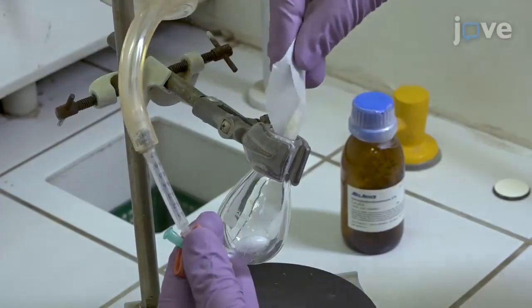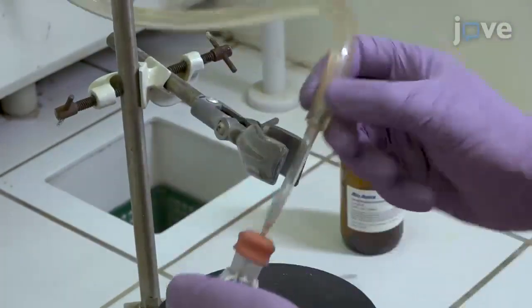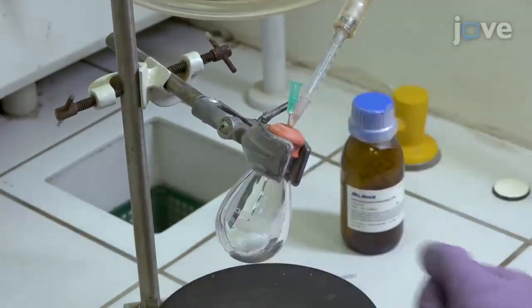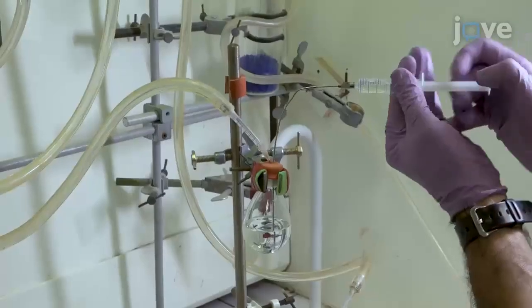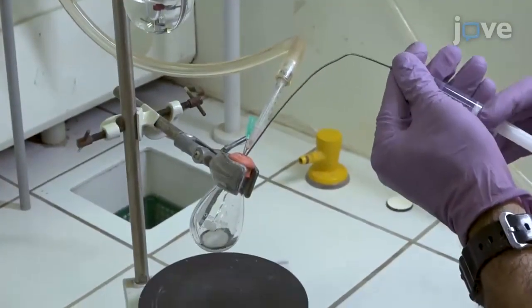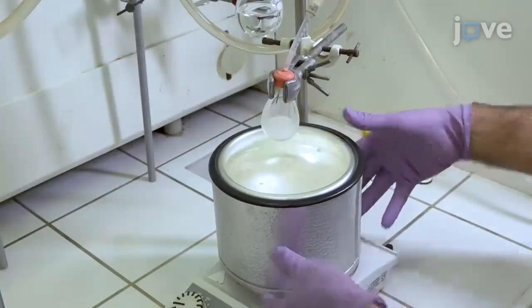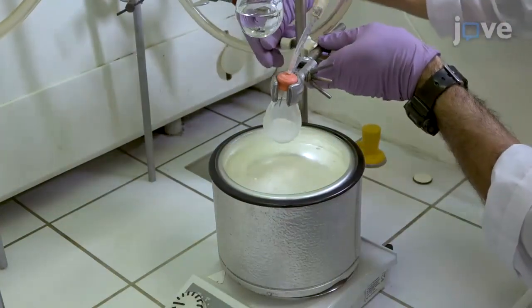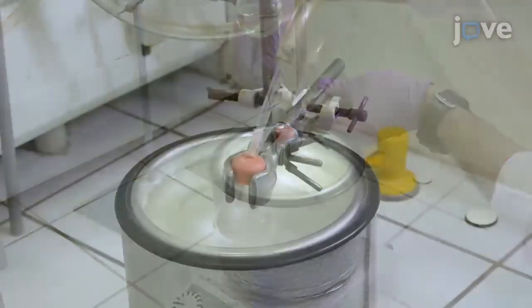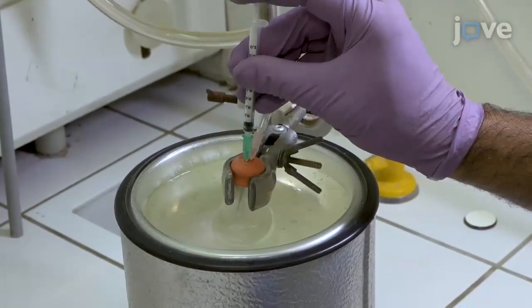In a dry round-bottomed flask equipped with a septum and a magnetic stir bar, add 1.5 equivalents of Koser's reagent and flush the flask with nitrogen or argon. Add dry dichloromethane to give a formal concentration of 0.234 millimoles per liter. Cool the resulting suspension to minus 78 degrees Celsius using a dry ice acetone bath. Then add 1.5 equivalents of neat boron trifluoride etherate slowly.